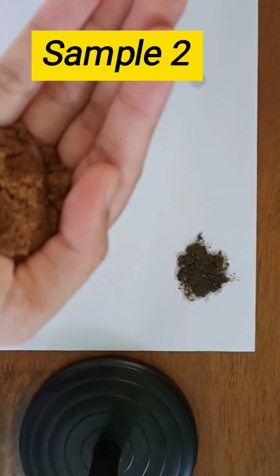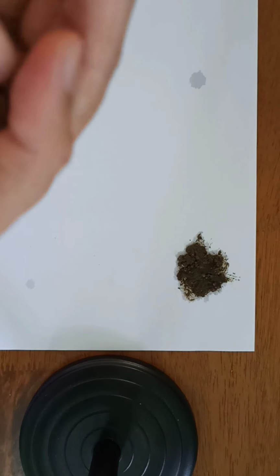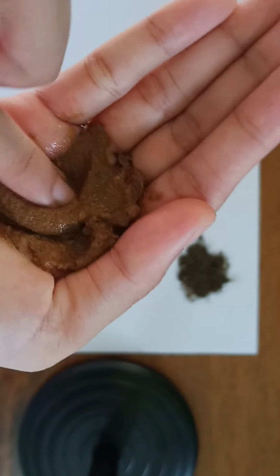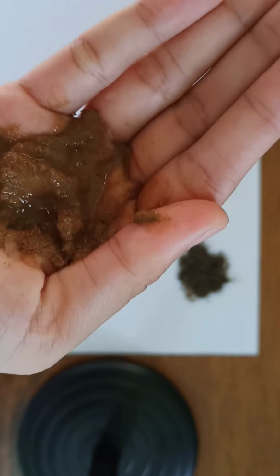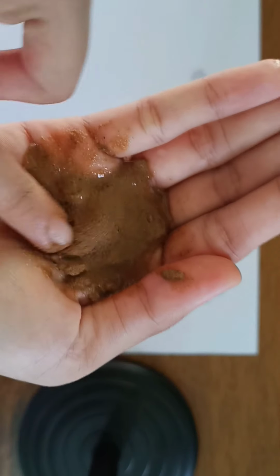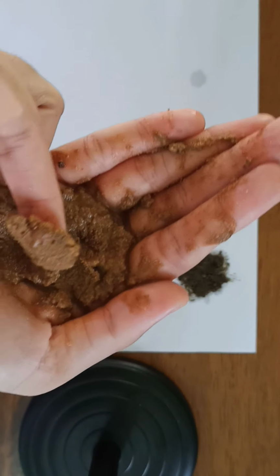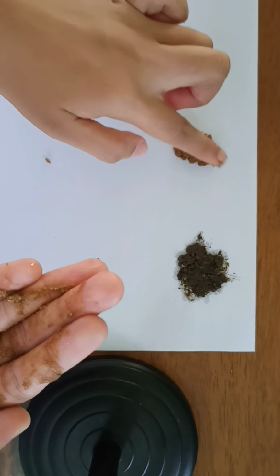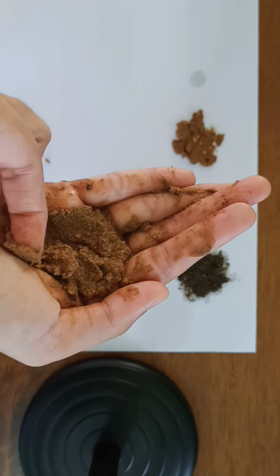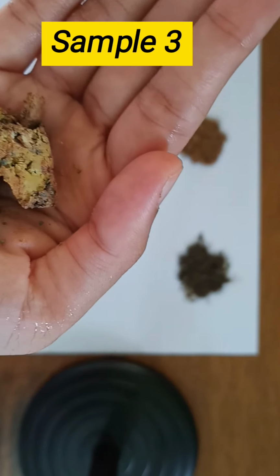Okay, so we are going to proceed with sample number 2. So we're going to put a little bit of water to make a paste. Okay, after we make a paste, smear a small amount. So we are going to proceed with sample number 3.